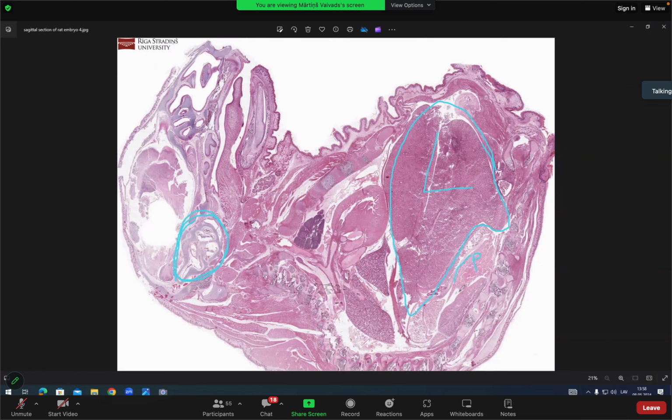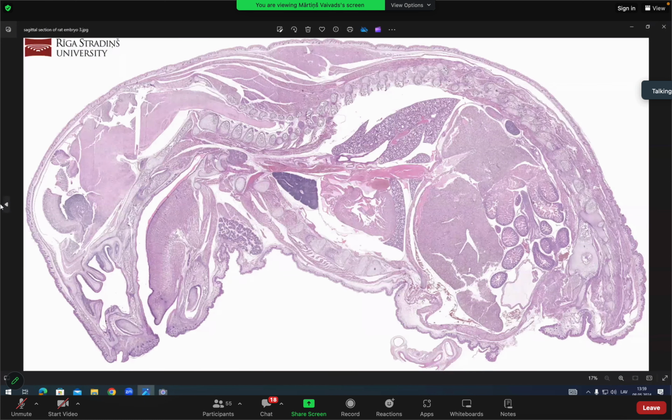And behind the liver, you see the pancreas, metanephros, and adrenal gland. So P, pancreas, and metanephros, A, adrenal gland. This is a very large slide also, but the tricky part is the structure. So there are slightly different variations. You can spot the inner ear, very big liver, pancreas, metanephros, adrenal gland. No intestines here. So that's special here. Then another variation.